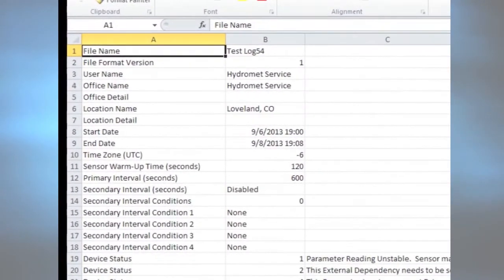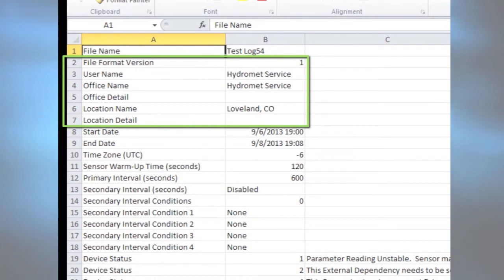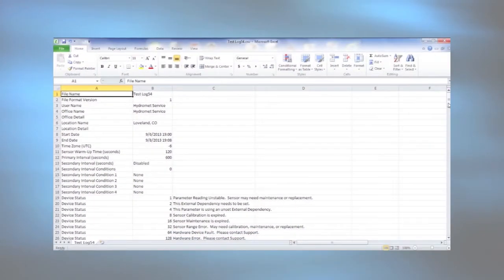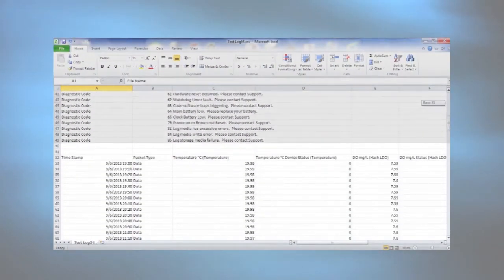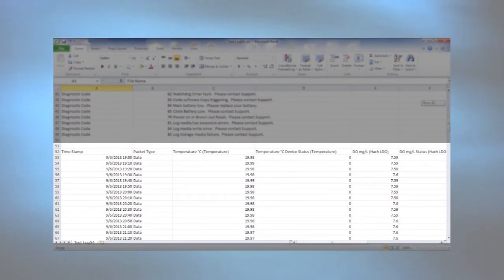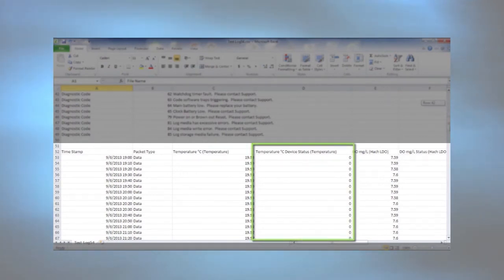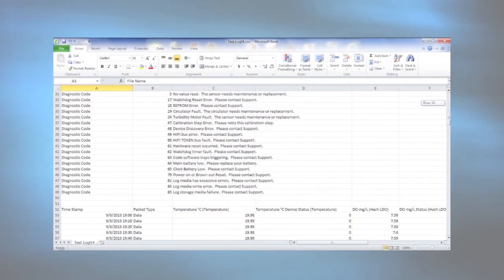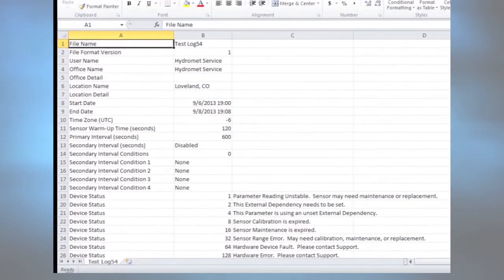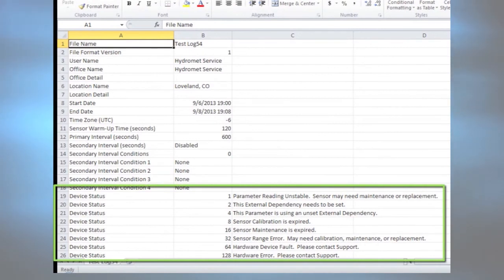The log file has important information in the header including optional user, office, and location information. Each parameter is stored with metadata for the measurement and a status code that tells about the quality of the data point. Status codes are explained in the file header.